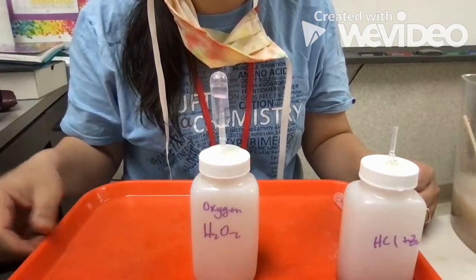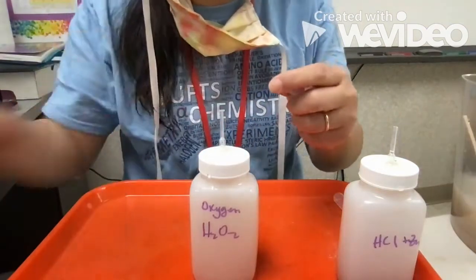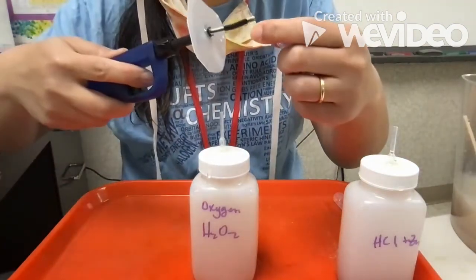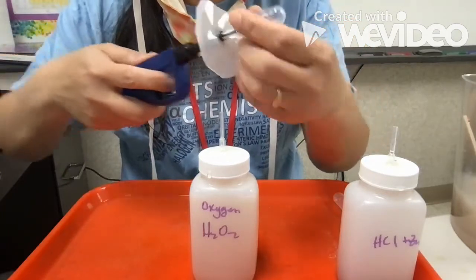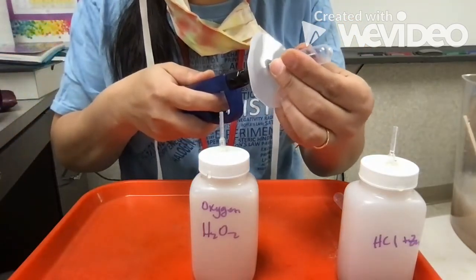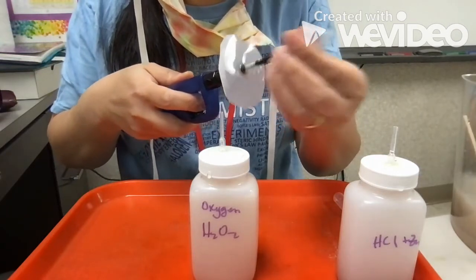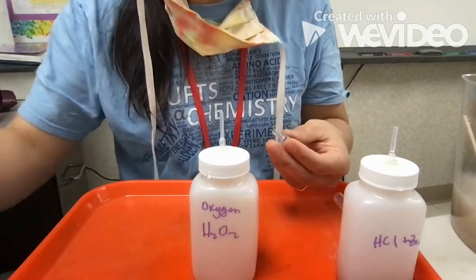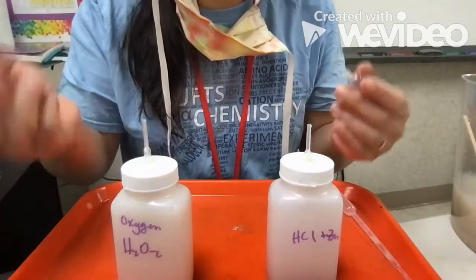Wow, that's going much faster than the hydrogen. I'm surprised. Okay, put your finger over it to hold it in. Take your sparker, put it in there, and make sure you hold it securely. Nothing.